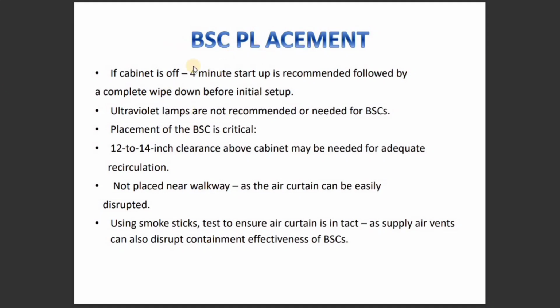Biosafety cabinet placement. If the cabinet is off, a 4-minute startup is recommended, followed by a complete wipe down before initial setup. Ultraviolet lamps are not recommended or needed for BSCs. Placement of the BSC is critical.